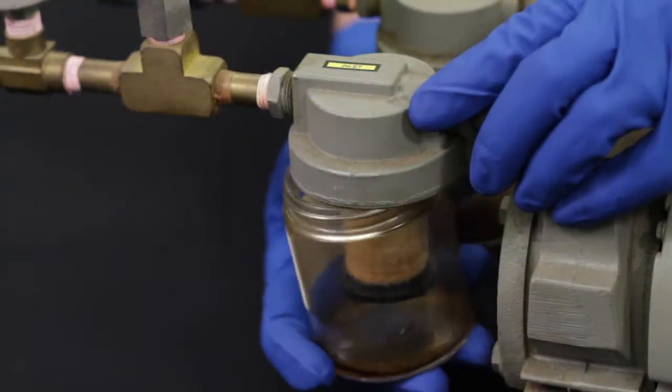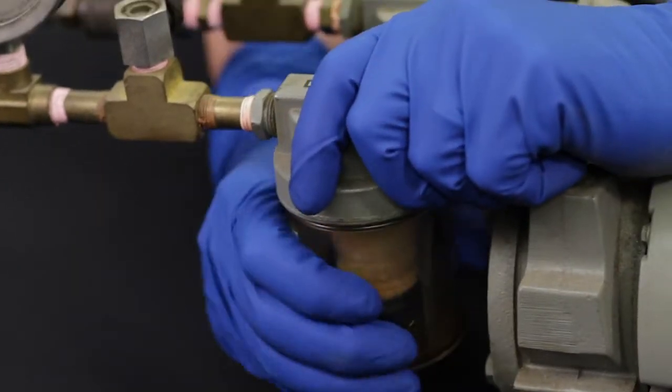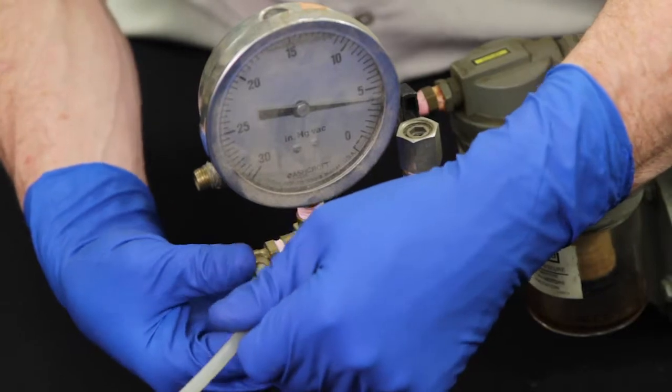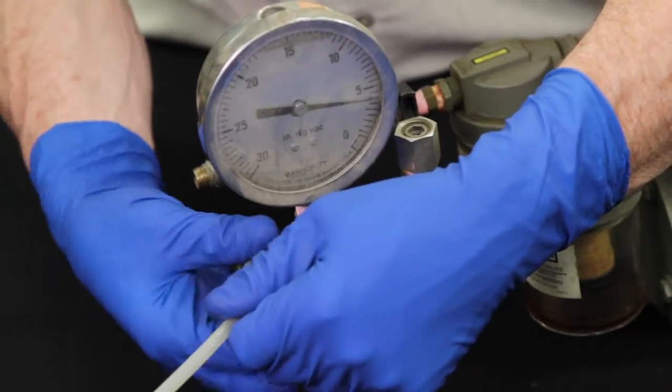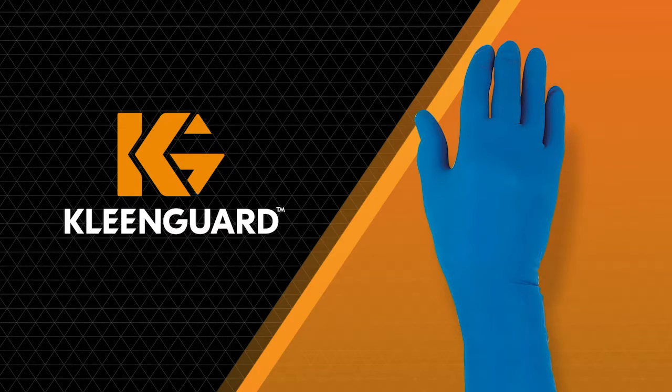So what does this mean for you? A worker using the G29 Chemical Glove will not have to compromise dexterity for chemical resistance. This means optimizing productivity with the right level of chemical protection — safety and productivity in perfect balance.